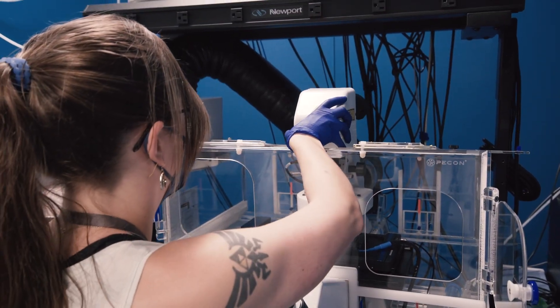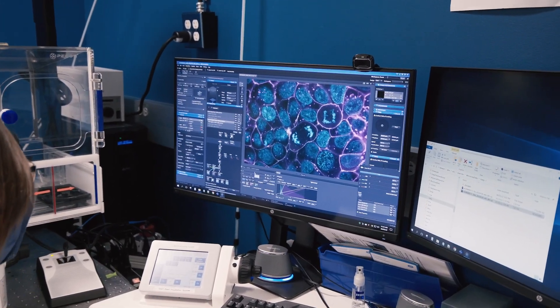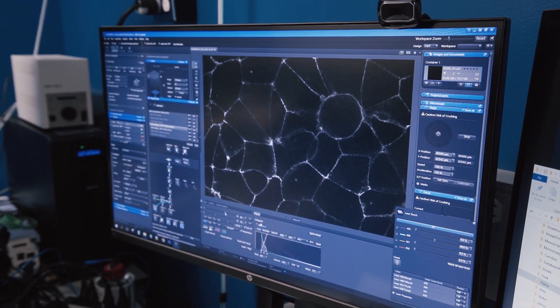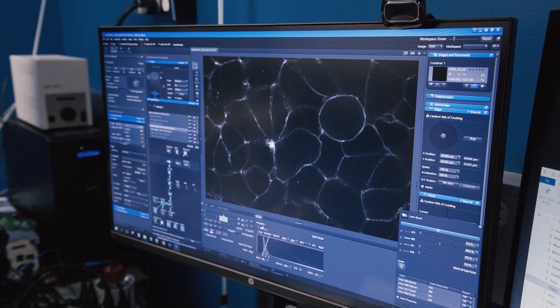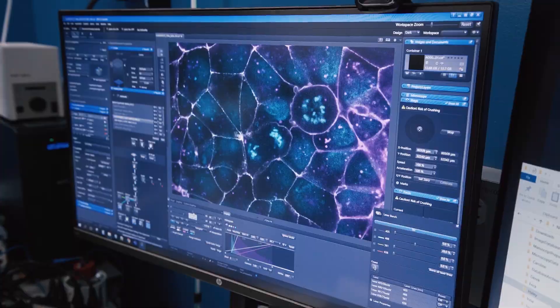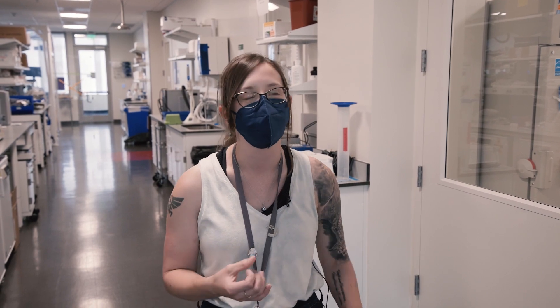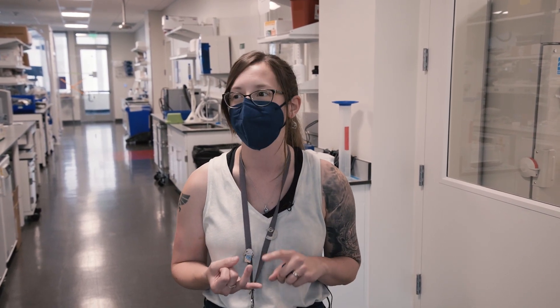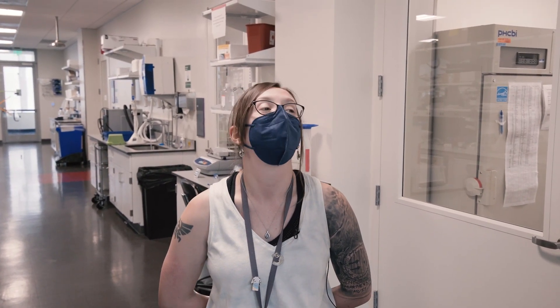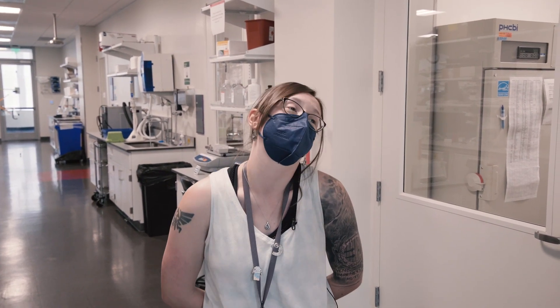What you're looking at right now is one of our gene edited stem cell lines. In white is the endogenously tagged protein CDH1, the pink is a cell membrane dye, and the blue is a DNA dye. We have all of our cell lines that we've QC'd and released, which can go into other labs — people that study the mitochondria, the Golgi — so they can use these lines in their own work. We basically want to create these cell lines and tools from the data we collect to empower the scientific community, and for me that's the most important thing.